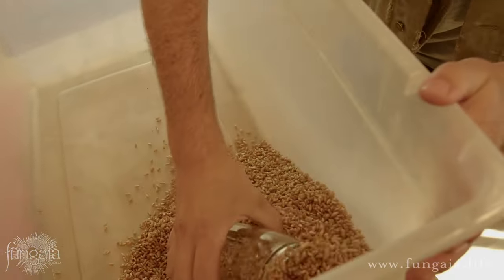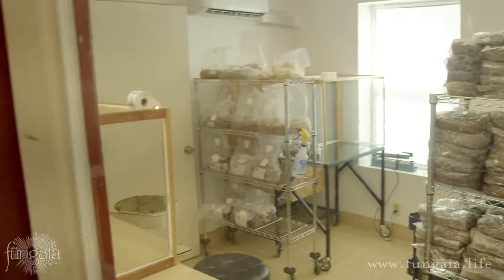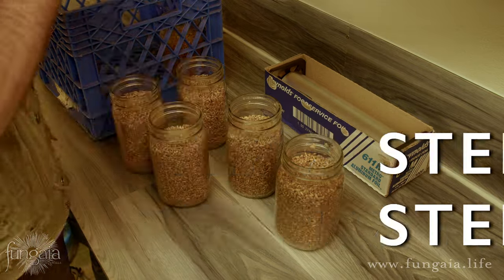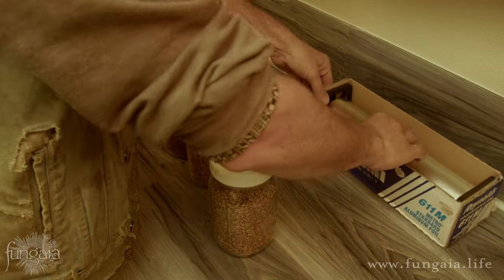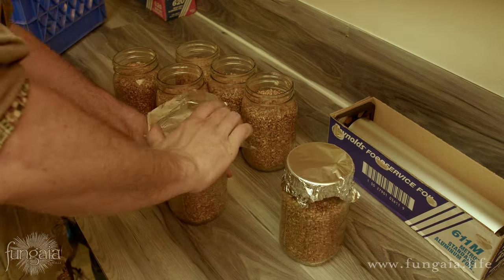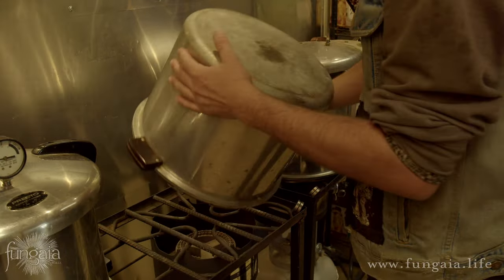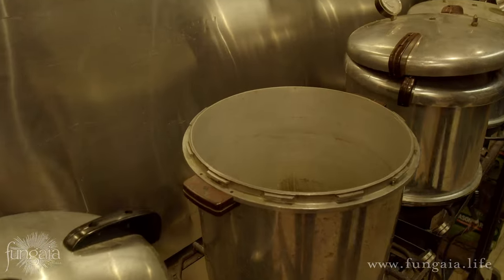Fill your jars about three-quarters of the way full to leave plenty of room for shaking and mixing the grain after inoculation. Next put on your filtered injection port lids, leaving them a little bit loose for the sterilizer — if possible it's always best to avoid putting sealed vessels in a pressure cooker. It's also a good idea to cover each jar with a piece of aluminum foil, which adds an extra layer of protection especially when you're unloading the jars from the pressure cooker and allowing them to cool.